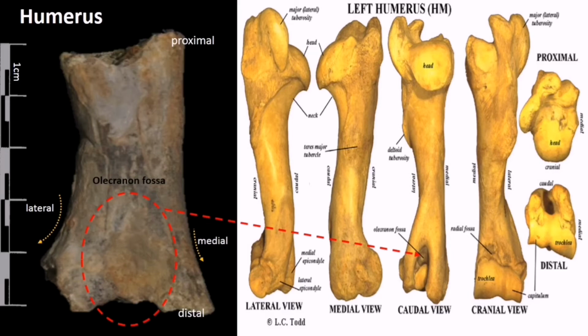You can see the lateral and medial part. Well, the humerus that was presented to me, I think it has been chopped, half of it probably, because the size is shorter. And you see the distal part of the humerus, the bone sample that I've got, the distal part has been chopped too. And look at the proximal. The proximal is actually longer than it should be.